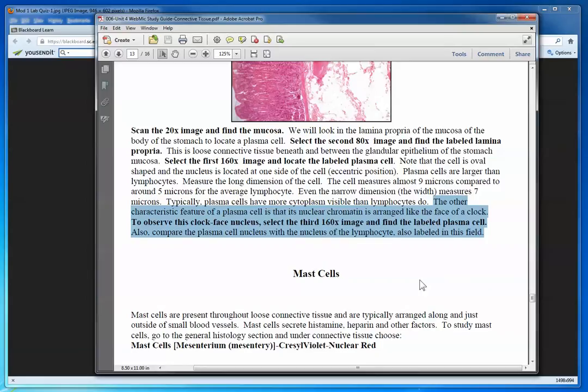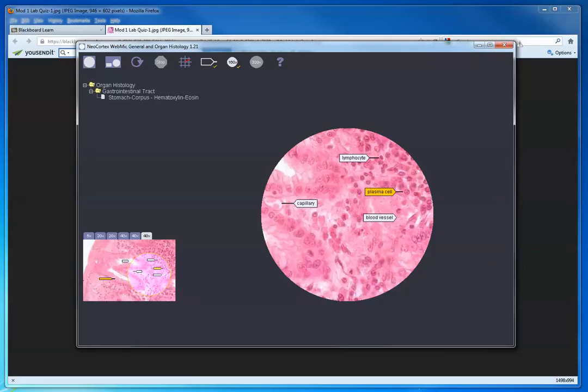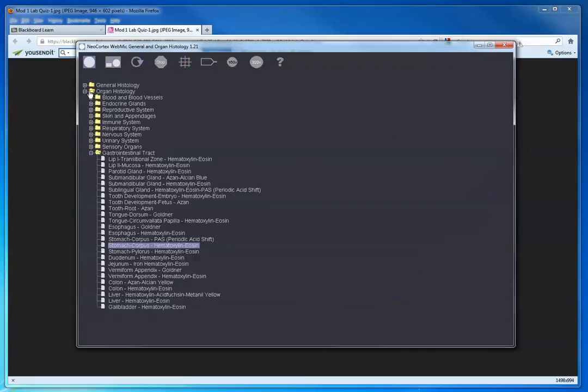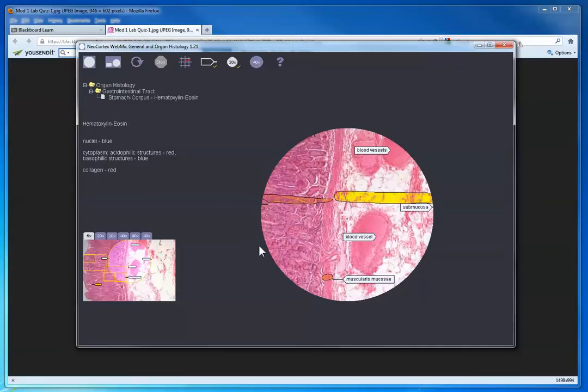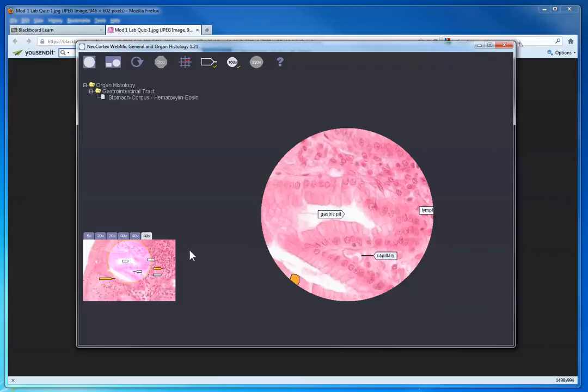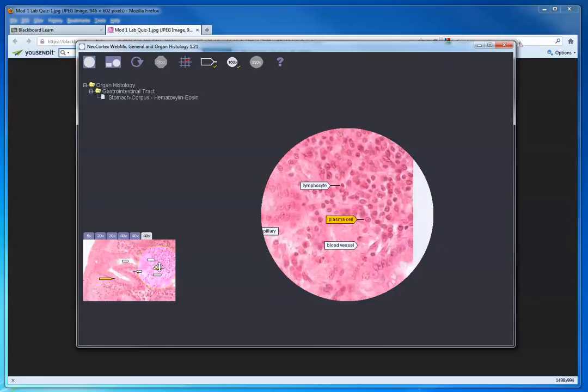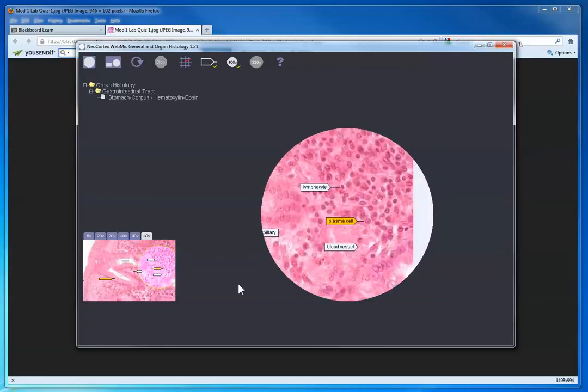Now I have the stomach corpus hematoxylin eosin. You see I was able to choose that here as instructed under the gastrointestinal tract, and there it is. You could look at all these images, but you're instructed to find the plasma cell on the third 160x image. 160x is always 40x times 4, which equals 160, and that was explained to you in the WebMic tutorial. I'm going to scroll over here and find the plasma cell.